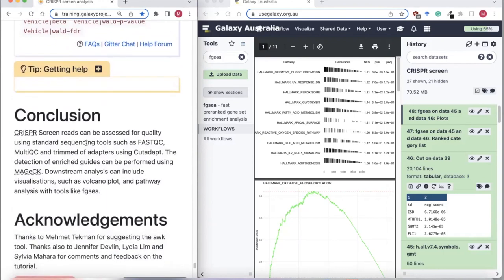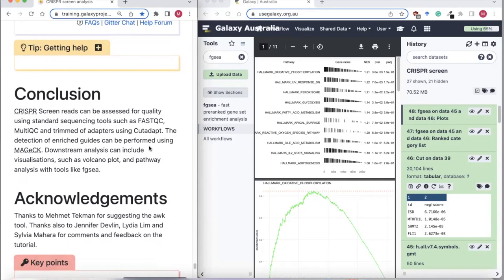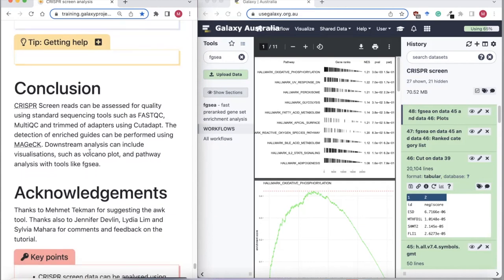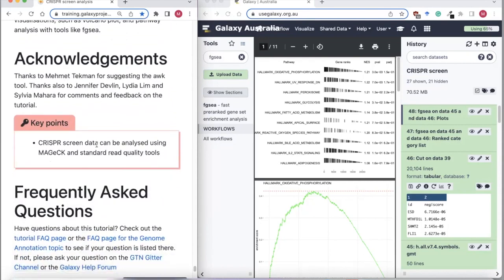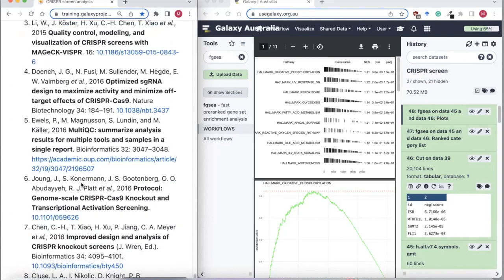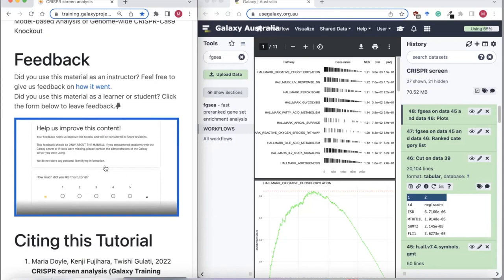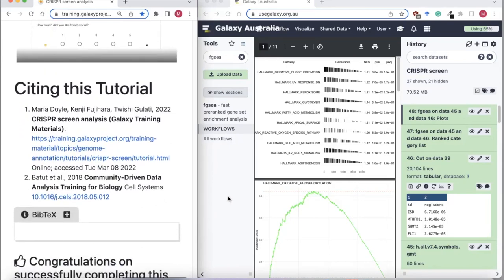Hopefully this tutorial has helped you see how to analyze CRISPR screen data — using standard sequencing tools such as FastQC, MultiQC, and adapter trimming tools like CutAdapt, and then how to use the MAGeCK toolkit to count your guides and test for differences in guide abundance across different conditions. We also covered downstream visualizations such as volcano plots and pathway analysis with FGSEA. There are links here if you want to get help, and we'd love it if you would complete the feedback form. Thank you very much for listening and taking part in this tutorial today.